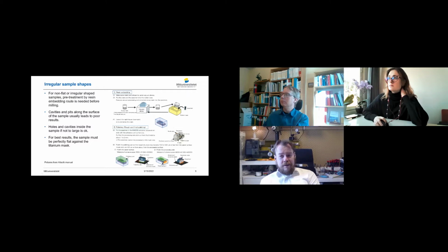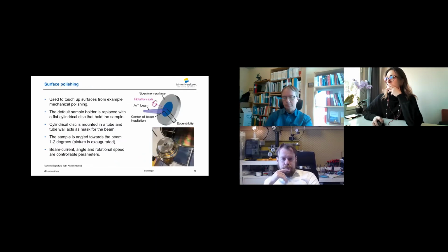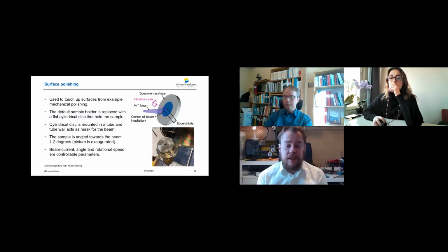It doesn't need to be surface mounted components. Let's say you have an electrode material that has a very rough texture on the surface and you want to study that, then it could be necessary to make a plastic coating of the surface to flatten it out. Besides cross-sectioning, you can also use this machine for surface polishing, and that can sometimes be quite neat.